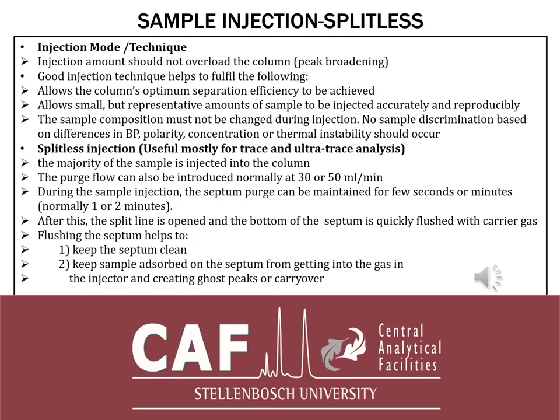But anyway, a good injection helps to fulfill the following. It allows the column's optimum separation efficiency to be achieved. It allows small but representative amounts of sample to be injected accurately and reproducibly. The sample composition must not be changed during the injection, and no sample discrimination based on differences in boiling point or polarity should occur.